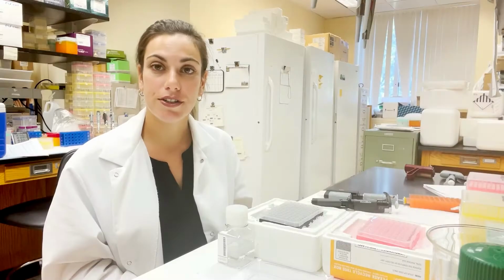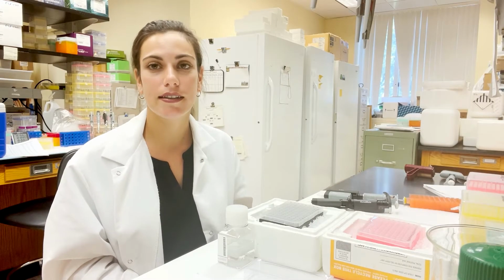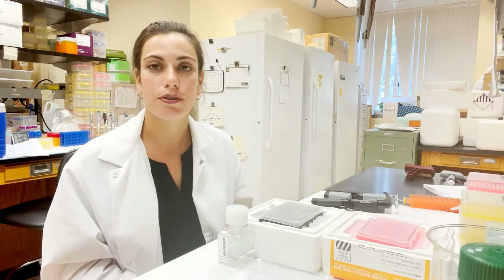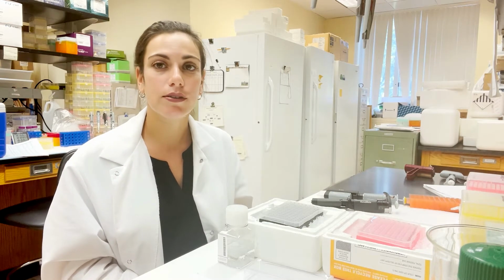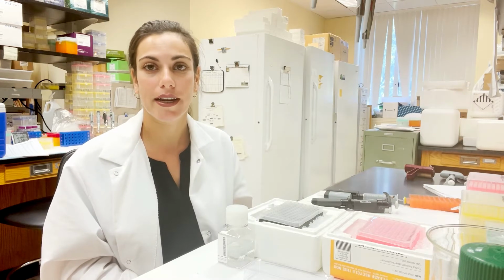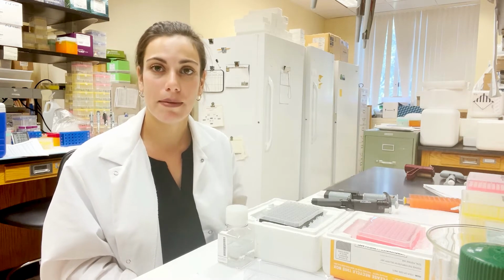The next step is a restriction digest. And in the case of ddRADseq, DD standing for double digest, we use two enzymes. The ones that we found to work on sweet basil were MspI and PstI-HF. So those will get added to our master mix.